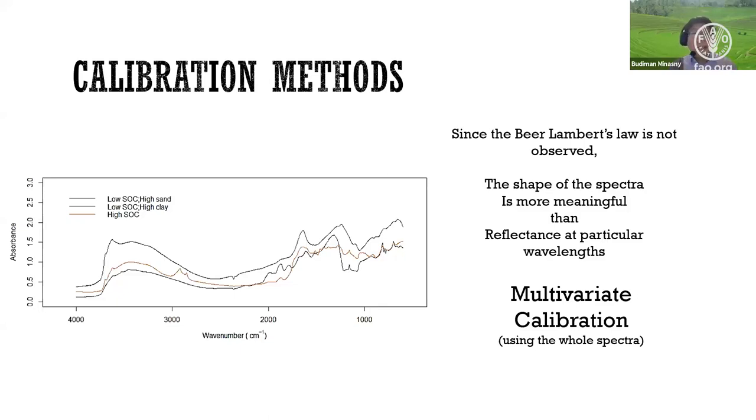And the whole spectra, people call it ultraspectral. Why ultraspectral? Because the whole spectra is about 2000 variables, right? On a drone or on a plane, a hyperspectral image contains around hundreds of bands, and multispectral, like in Landsat, the satellite images contain multiple bands, 4 bands, 5 bands, or 11 bands, or 20 bands, but hyperspectral contains hundreds of bands.